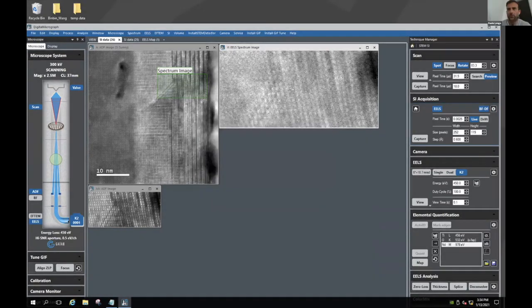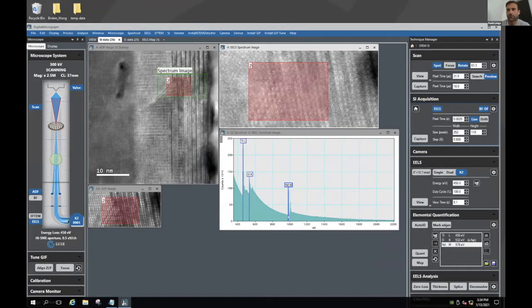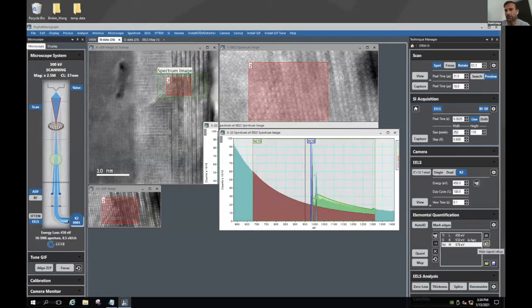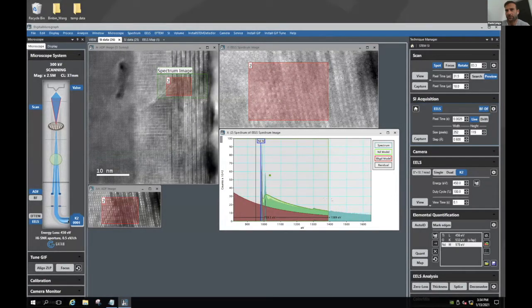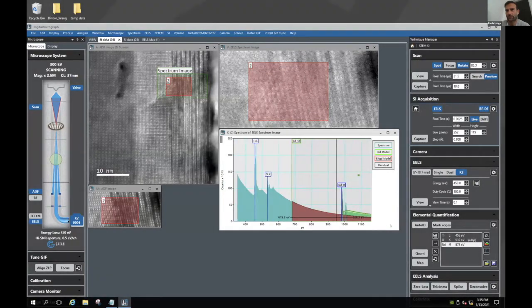Okay. Now, if you wonder what we have, you open a spectrum. For example, you look at the neodymium, and then you can click this button and you can even change the conditions. If you think, oh, I want to increase my energy range a little bit, you can do that. See, beautifully, you see all the edges there. You can increase it there. Look at the quality now, it's really good. You could see the same thing for the other elements as well.